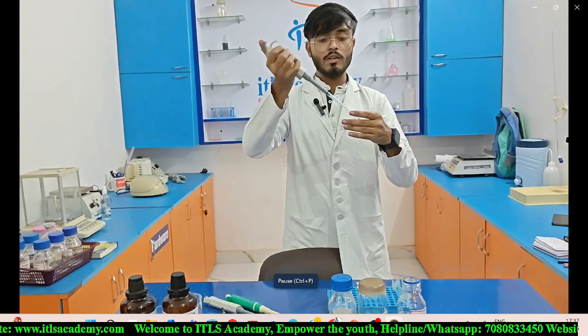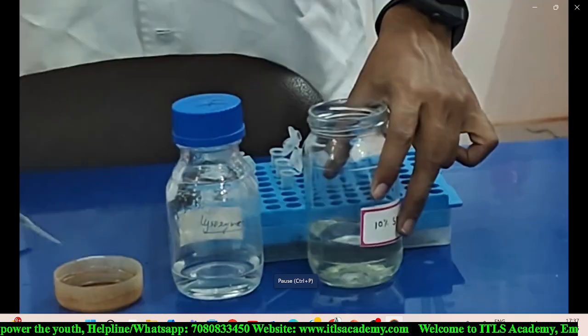So after adding 0.5 ml of TE buffer to each eppendorf, now we need to add 75 microliter of a 10% SDS solution in each eppendorf.